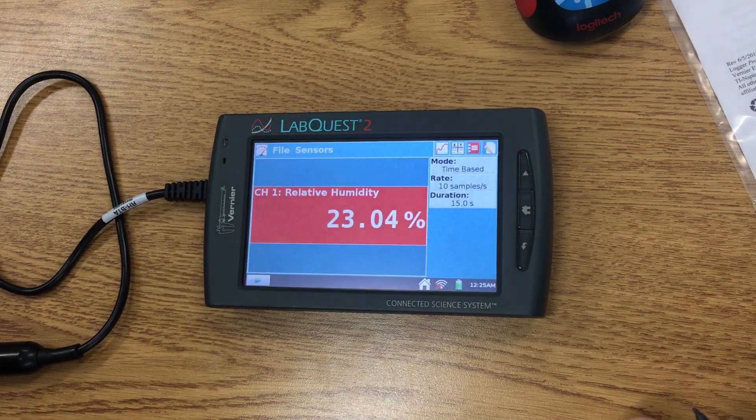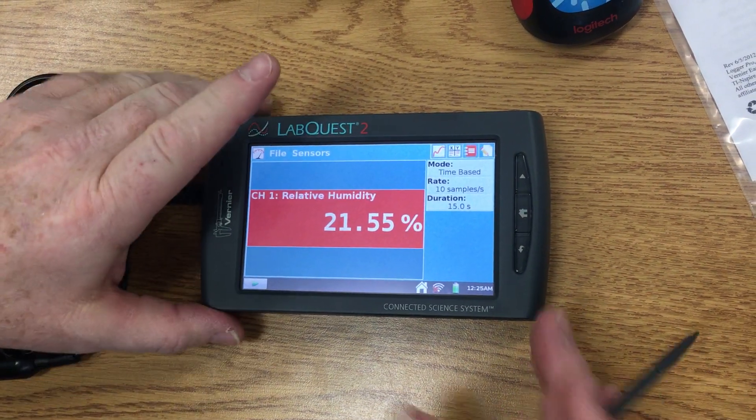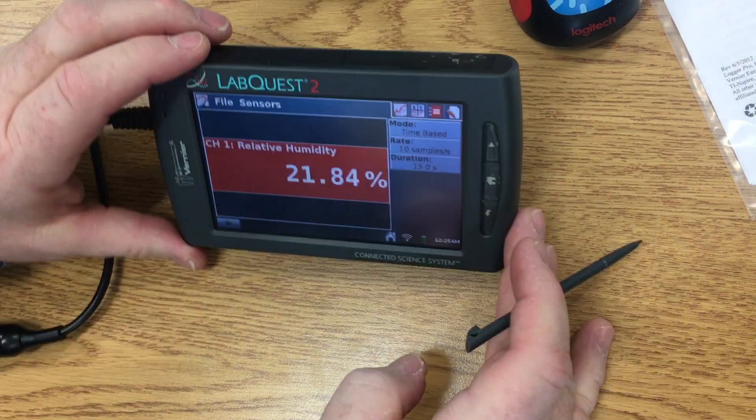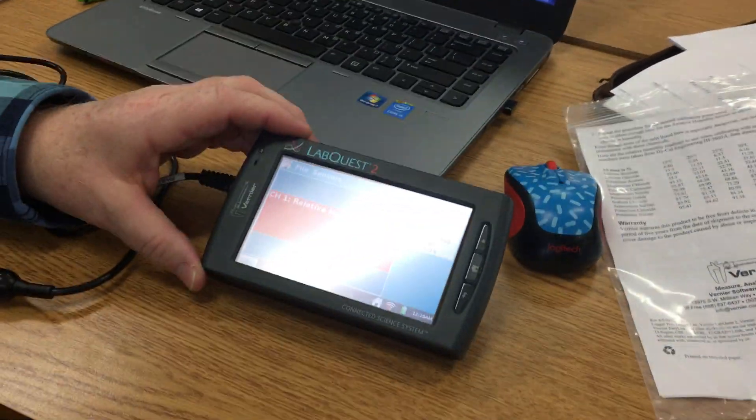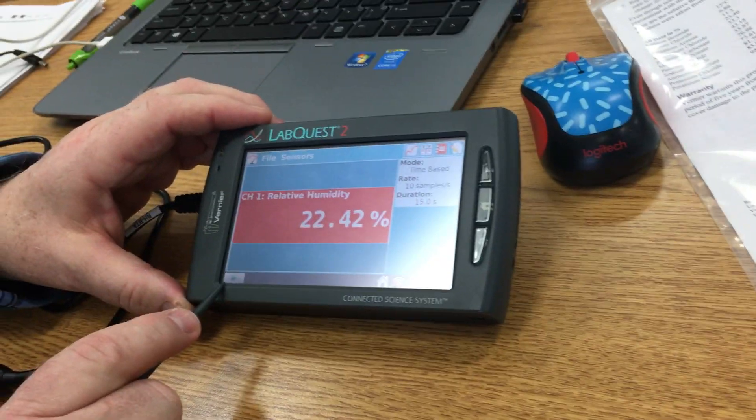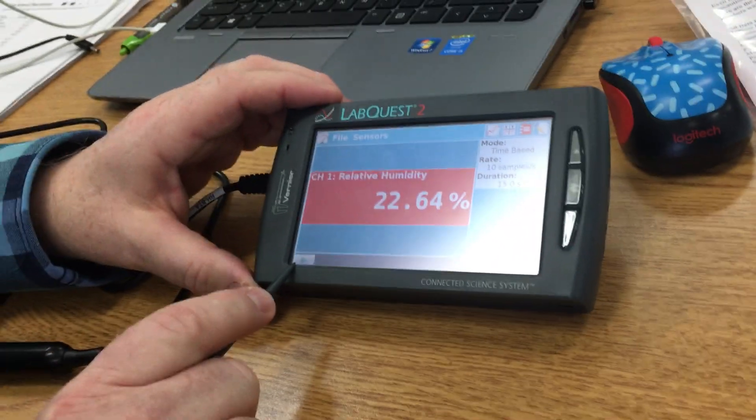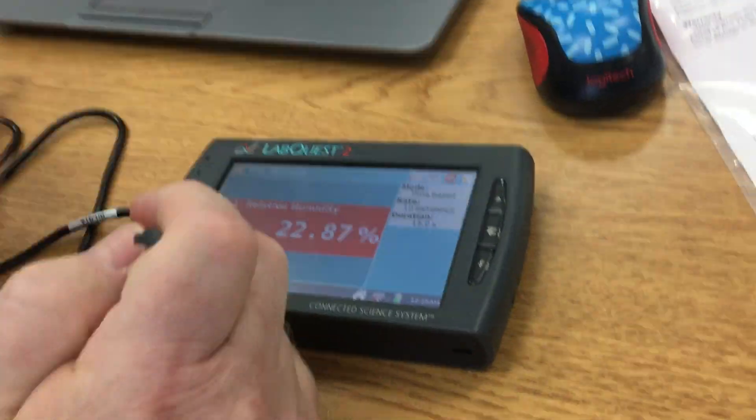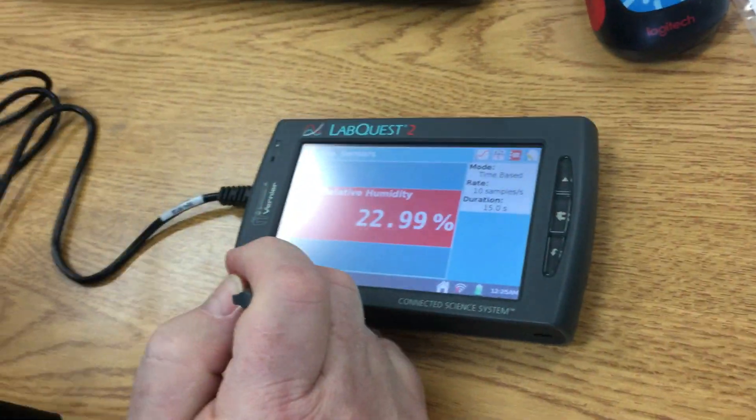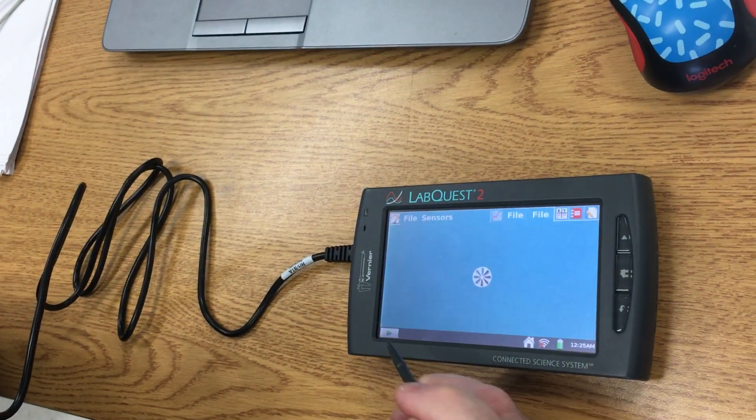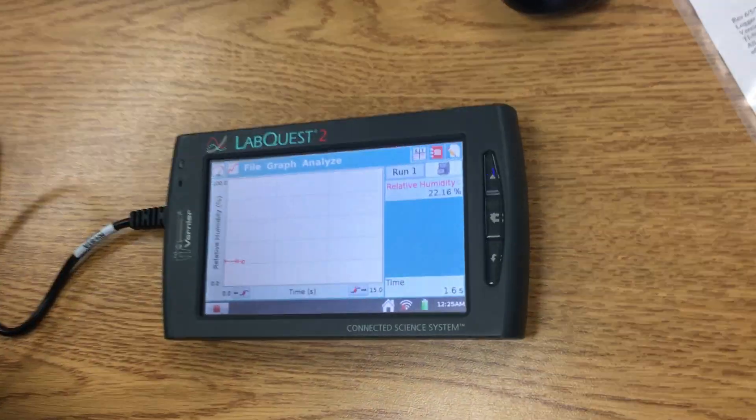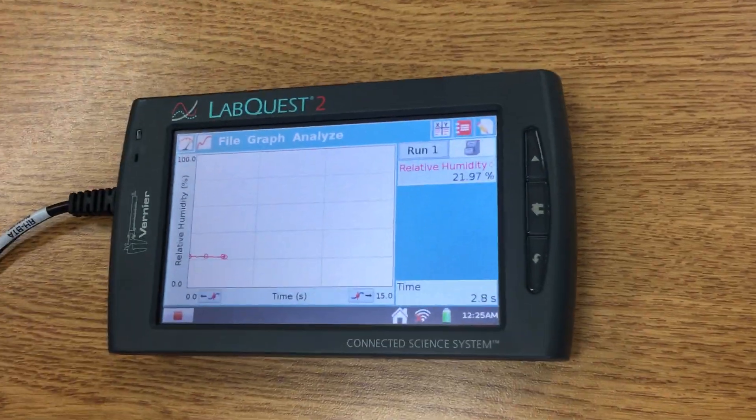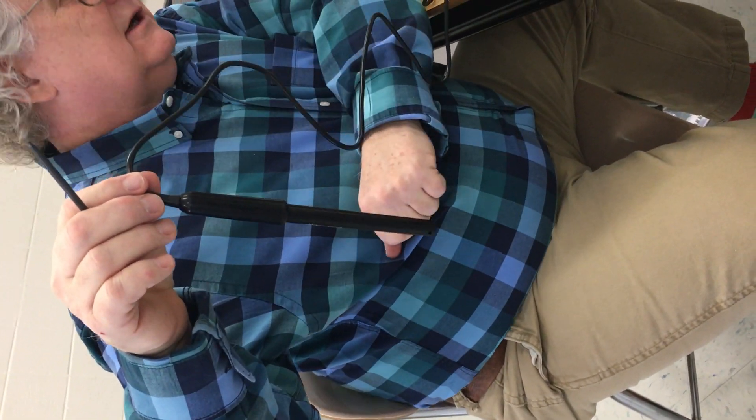Now we're ready to begin sampling. Notice there's this go button. We're going to click on that go button and it's going to start collecting data. You want to hold the sensor down like this; you don't want to touch it because that will influence any kind of humidity around it.